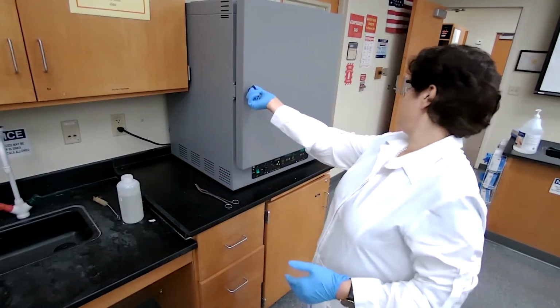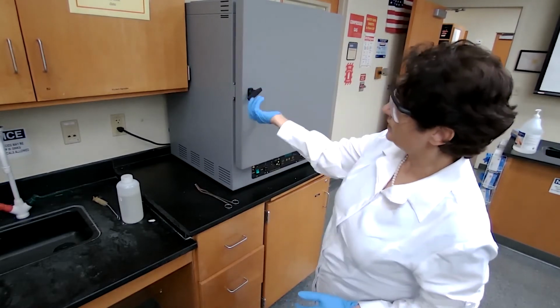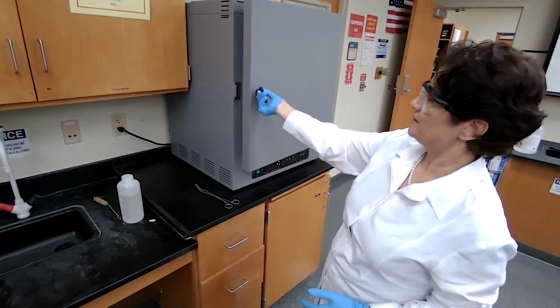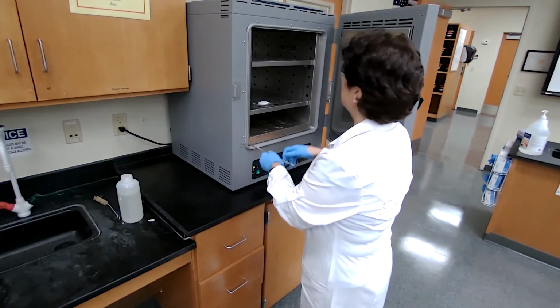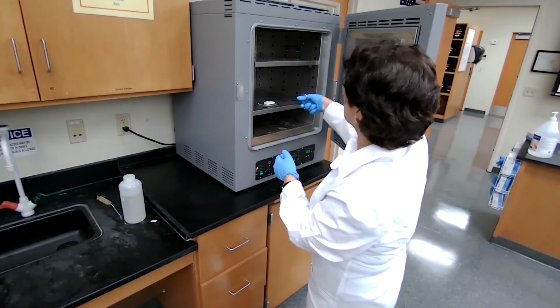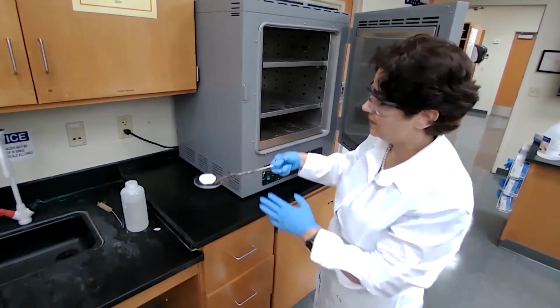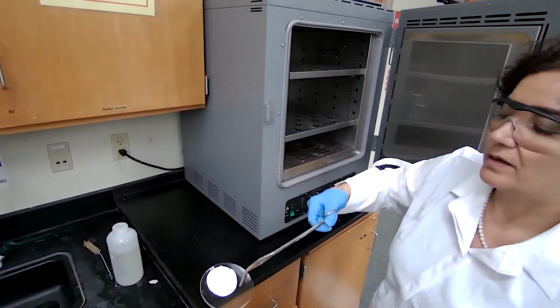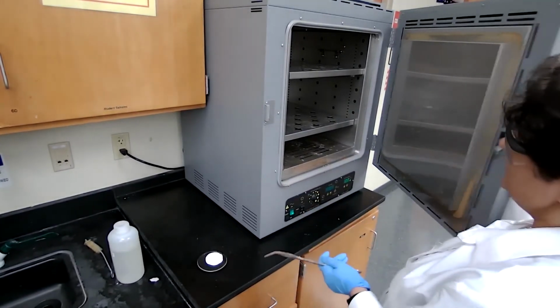Okay, it has been 5 minutes or more for this sample. I just turn to the left side, the oven will open, and I remove the sample from the oven. It's hot, so I would use either a hot glove, or for small samples, I can use tongs to remove it. And close the oven.